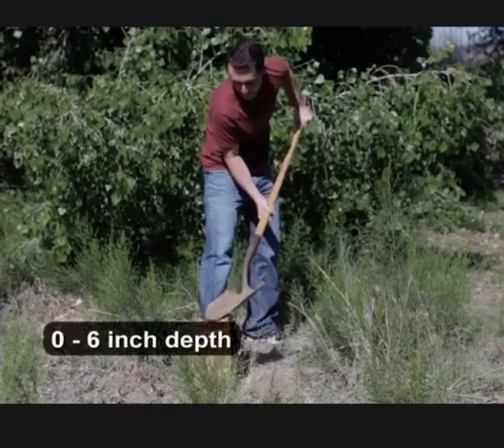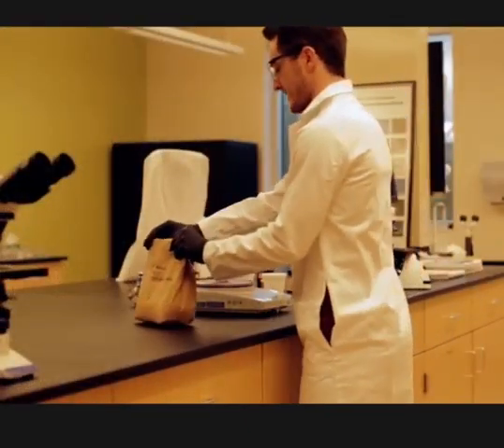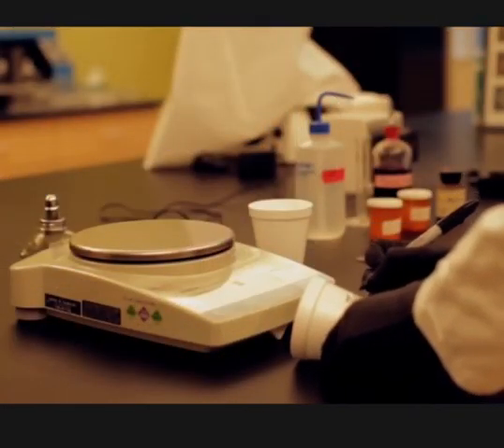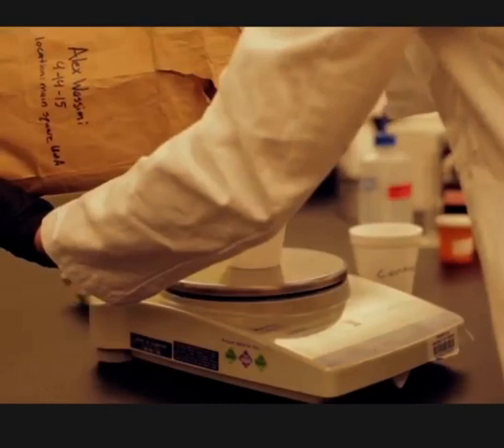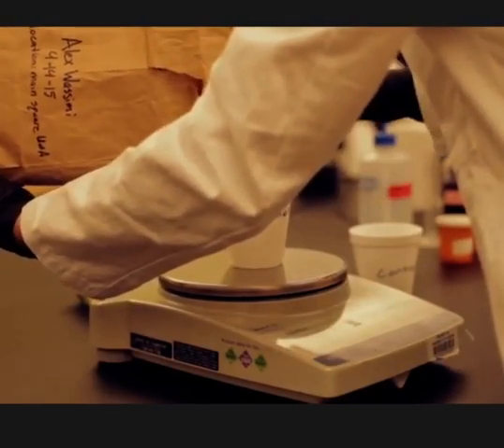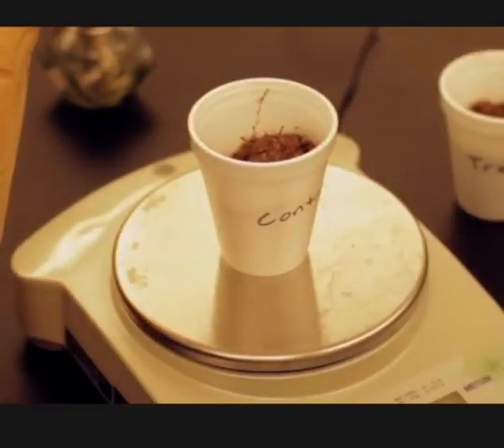First, collect surface garden soil and transfer the soil into the lab. Weigh 150 grams of soil into two separate containers. One container should be labeled as the treatment sample, which will be modified with nutrients to encourage rapid proliferation of organisms. Label the other as the control, which will be unchanged.